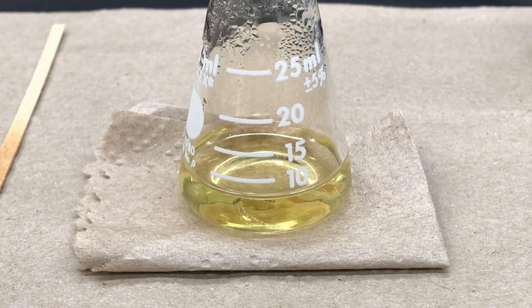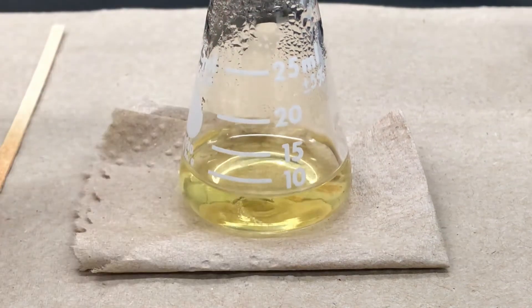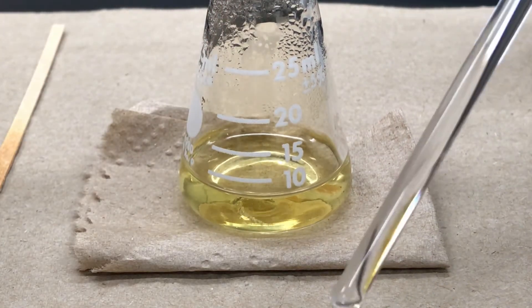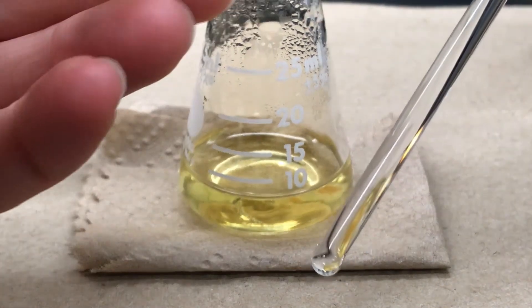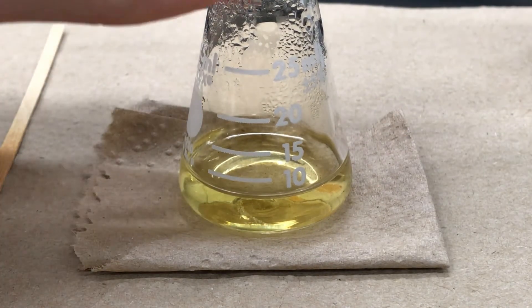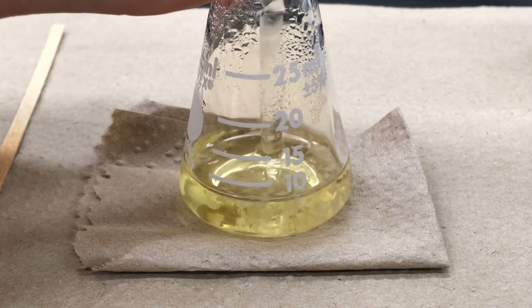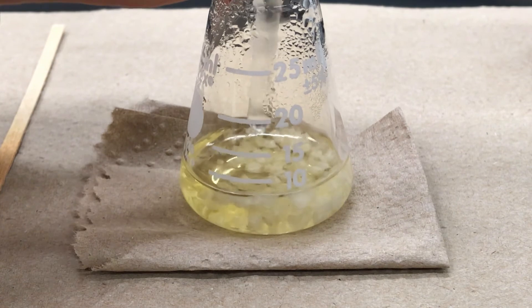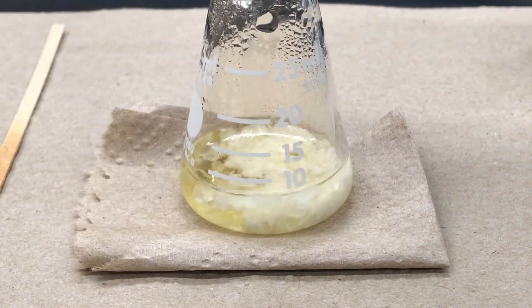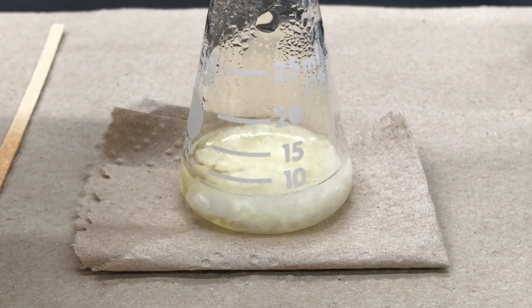As you cool the solution, crystals should naturally start forming, but it's not uncommon that they have a hard time getting started. If you touch the flask and it's only slightly warm with still no crystals, you may need to get it started. Take a glass stirring rod and scratch the bottom of the flask — that will normally initiate crystallization. Once you see solid forming, the process is on its way and you can let it go.